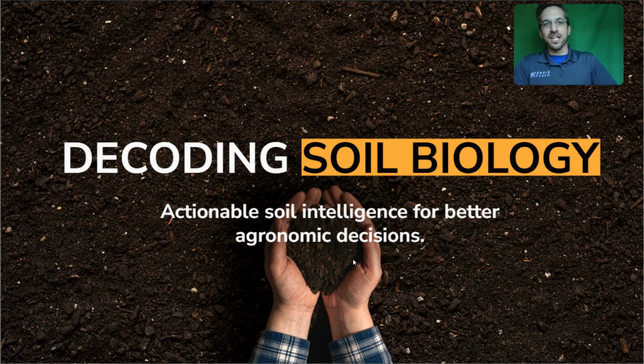Hello, this is a video for those who've received their BeCrop Test results and would like a walkthrough of the report to better understand what those results mean.